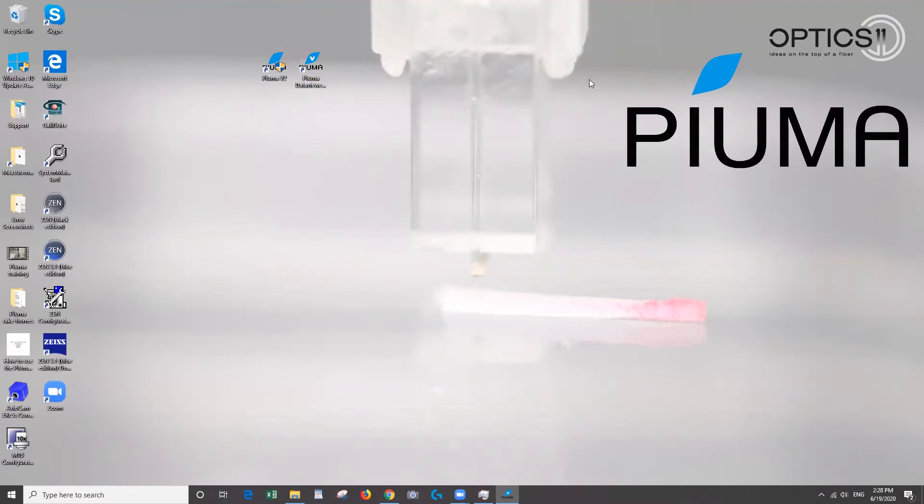Hi everyone, this is Jessica Speer. I'm a research scientist at MRL. I work in the scanning probe microscopy core and today we're going to look at how to use our Piuma on a sample in air.